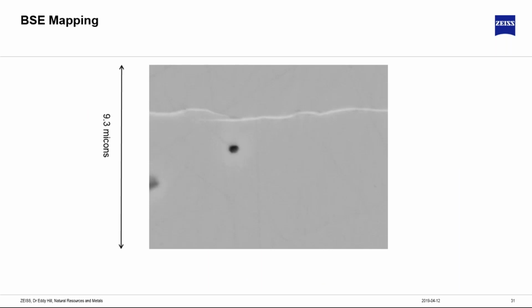I have an example here. What we have is an image. It's 9.3 microns high, and the vein cutting through it ranges from 128 to 25 nanometers in width. The EDS analysis of that vein would not provide us with any sort of classification. It's a chalcocite in pyrite.